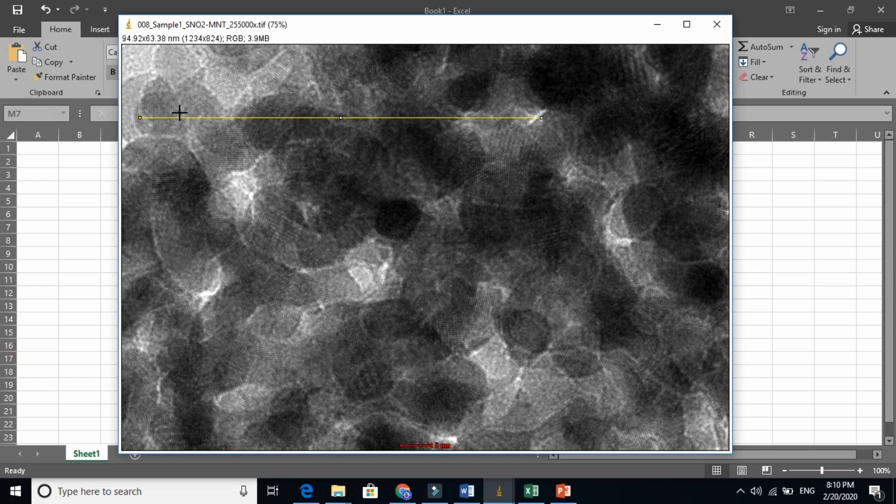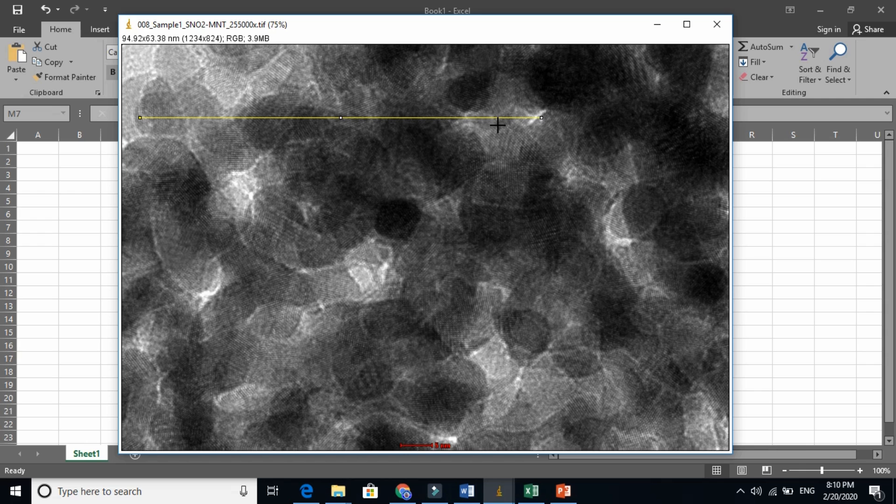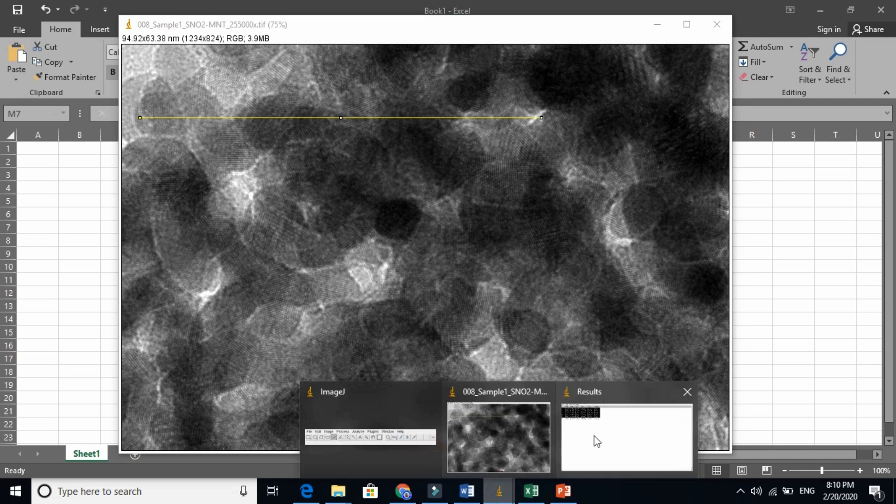One grain, two grain, three grain, four grain, five grain, six grain, seven grain. And you will see now, and divide that length by seven.